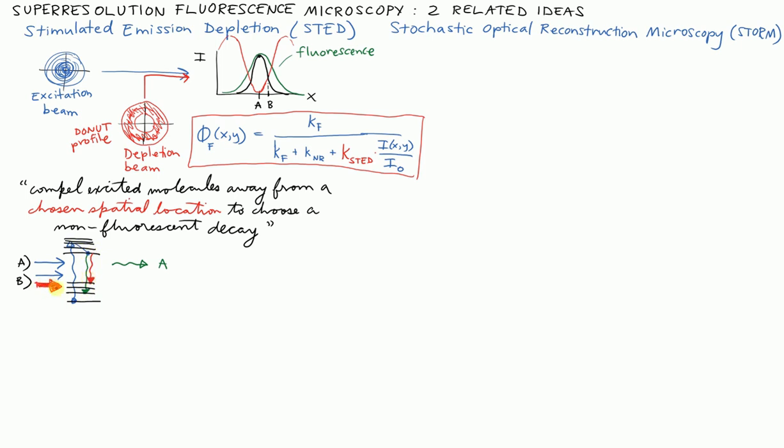That's the nature of stimulated emission, is the wavelength of the stimulating beam drives the emission of a photon at that very color. So in situation B, it's much more likely to get a red emitted photon than a green one. And that is why at location B, you have less green light than you would have otherwise.